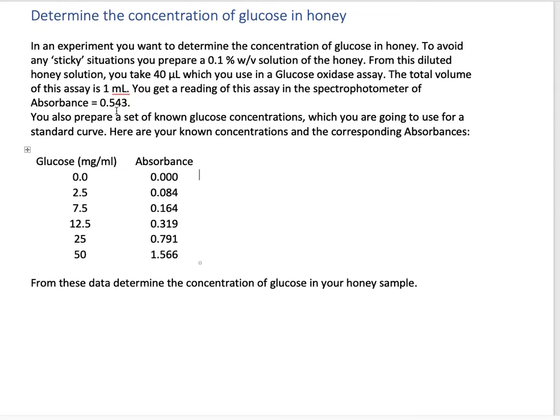This spectrophotometric assay measures an absorbance of 0.543.